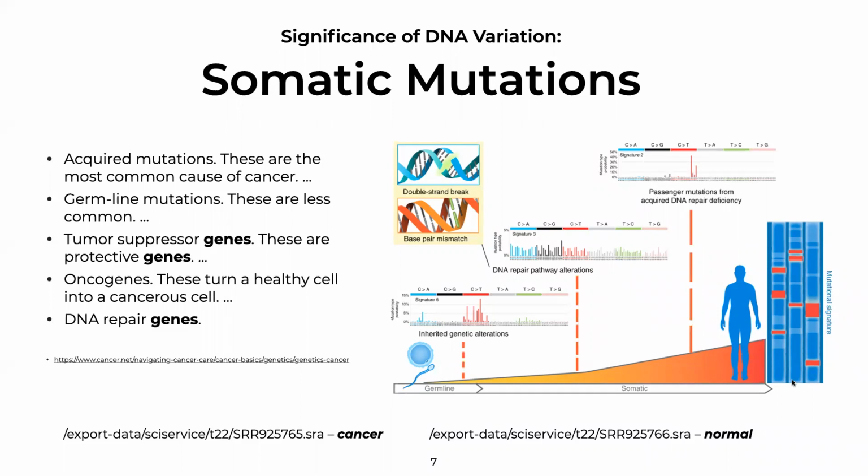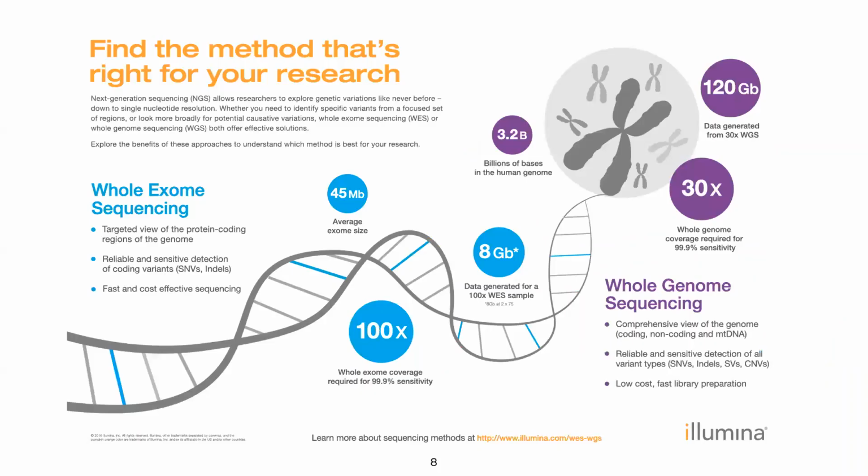So talking about somatic mutations, we also talked about how to detect those somatic mutations in next generation sequencing data. And we discussed a number of different types of sequencing where we can look at whole exome sequencing, whole genome sequencing, or targeted sequencing. Targeted sequencing provides us with the biggest coverage, but only in specific genes that we are focused on.